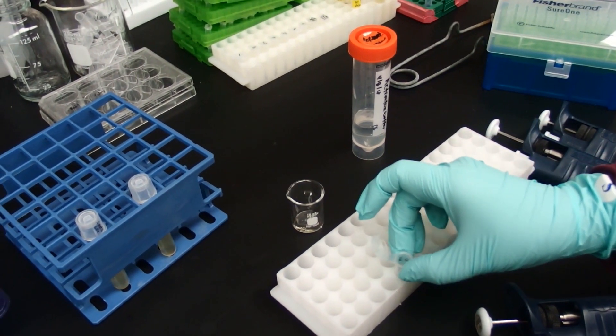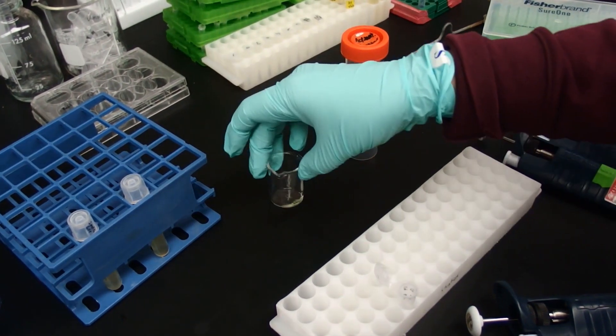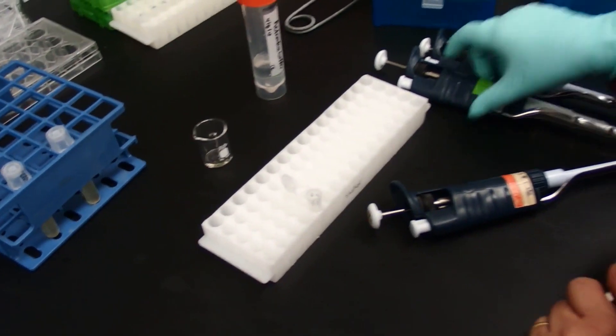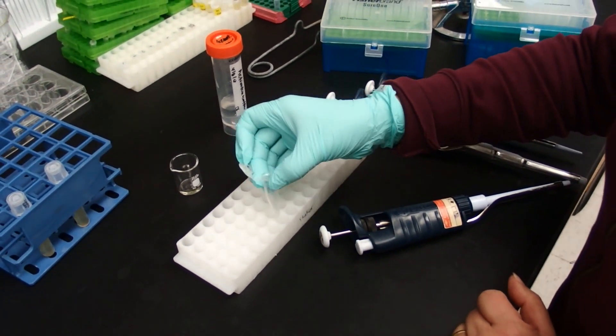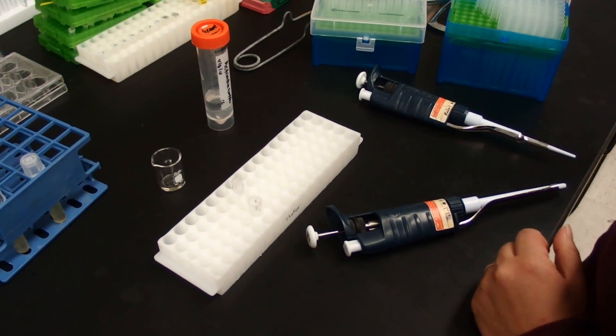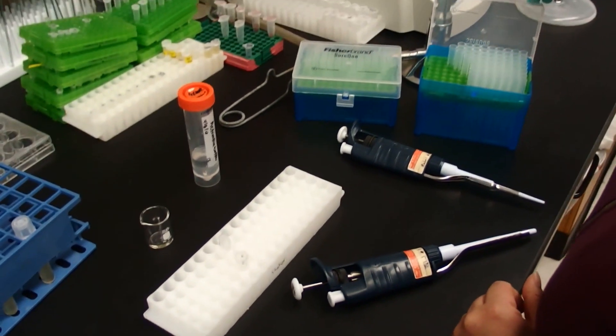We are going to add bleach to the waste container and later on clean it up. Now we are going to add 1 ml of activation buffer to our bacteria.